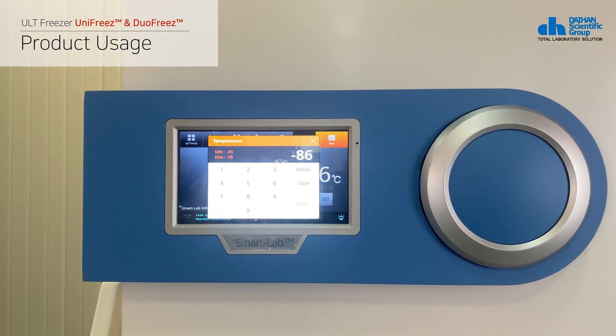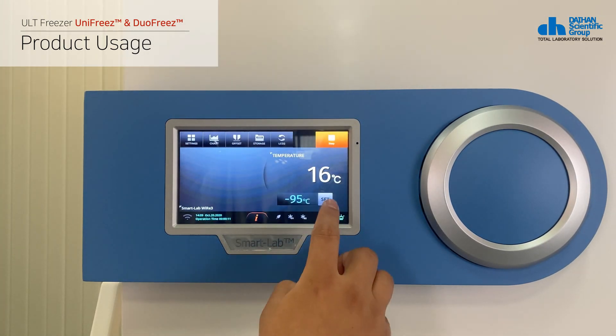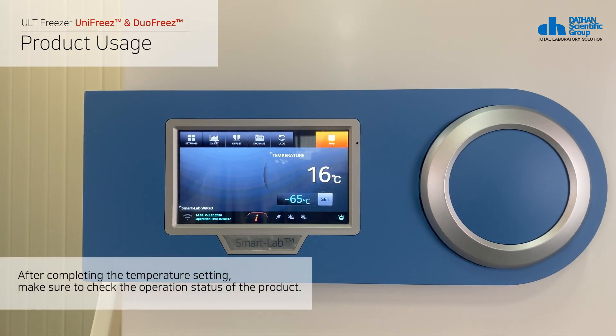The following is how to set the temperature. You can set the temperature by clicking the set button next to the set temperature. Please check the exact specifications of the product since the usable temperature range for each product is different.